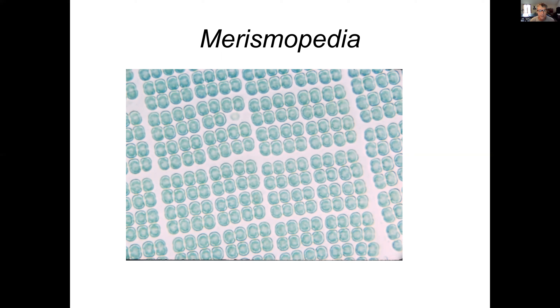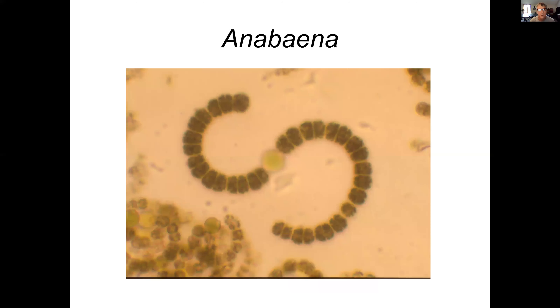You can see there's no clear chloroplast or nucleus in there. It also has this blue-green color because of the pigments, and that's something that will help you set it aside. This one's called Anabaena, and it has a heterocyst — a nitrogen-fixing cell — in the center of this S-shaped series of connected cells.